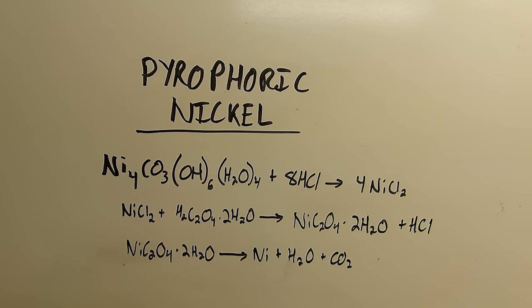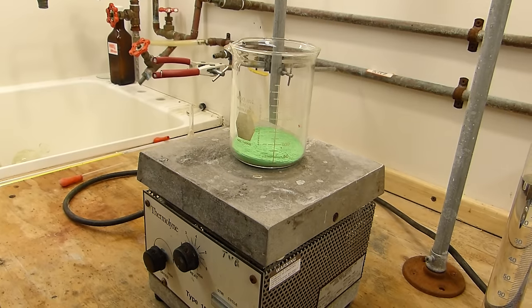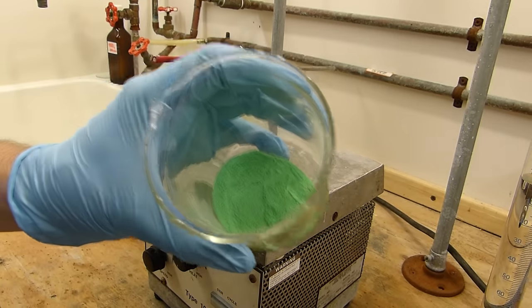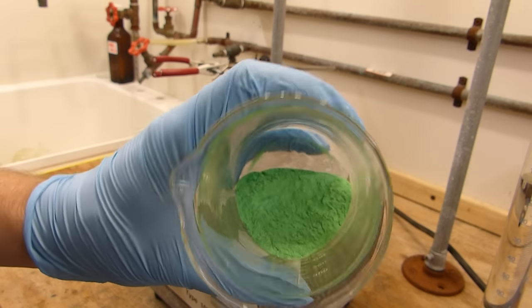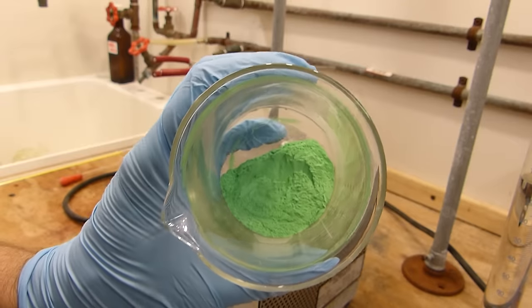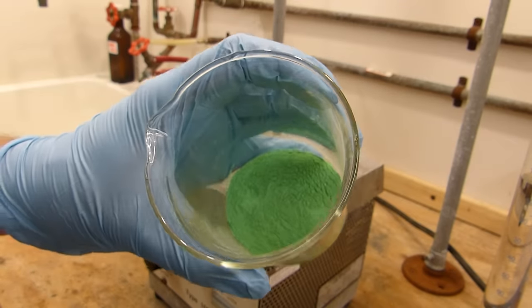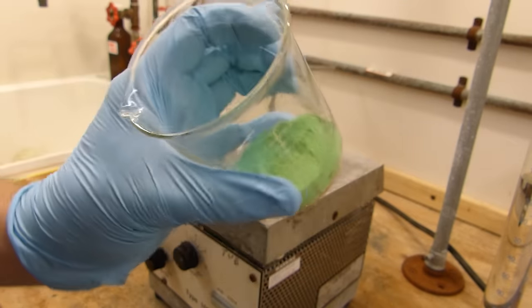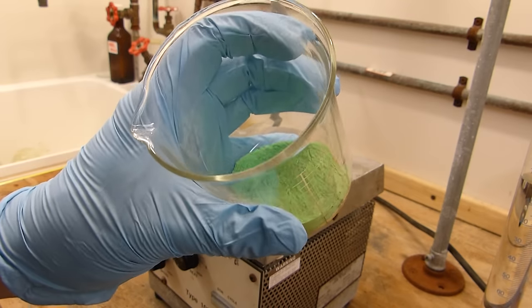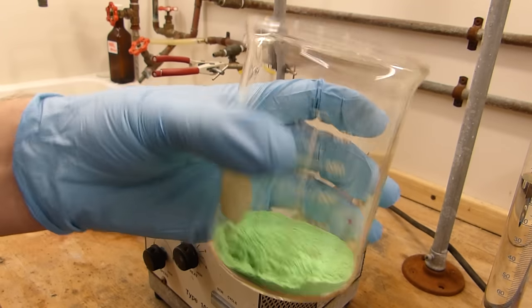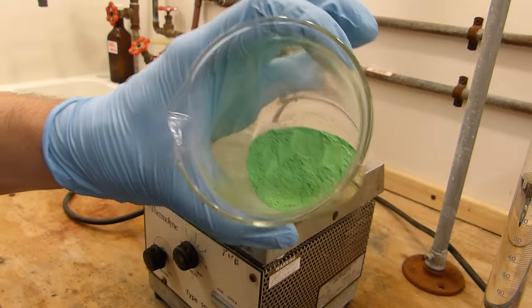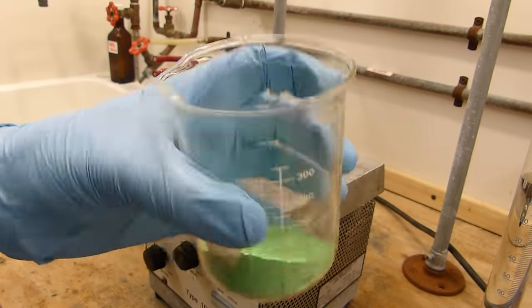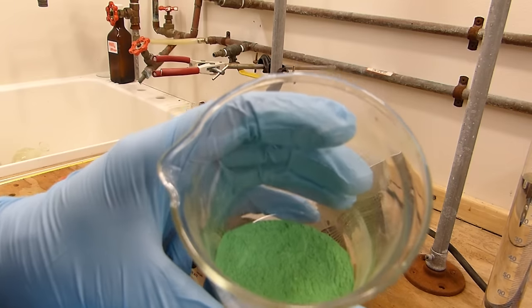So we're going to go ahead and do that now. I've set up for the experiment by first placing 45 grams of basic nickel carbonate in the bottom of the beaker. You can see it takes the form of a free-flowing light green powder. It's very dense. It's not very pure because it's pottery grade but any impurities that might be in here will probably be of the sodium, potassium, calcium or maybe even magnesium variety, which means that the hydrochloric acid is going to serve to purify this anyway because those will be much more soluble than the nickel oxalate.